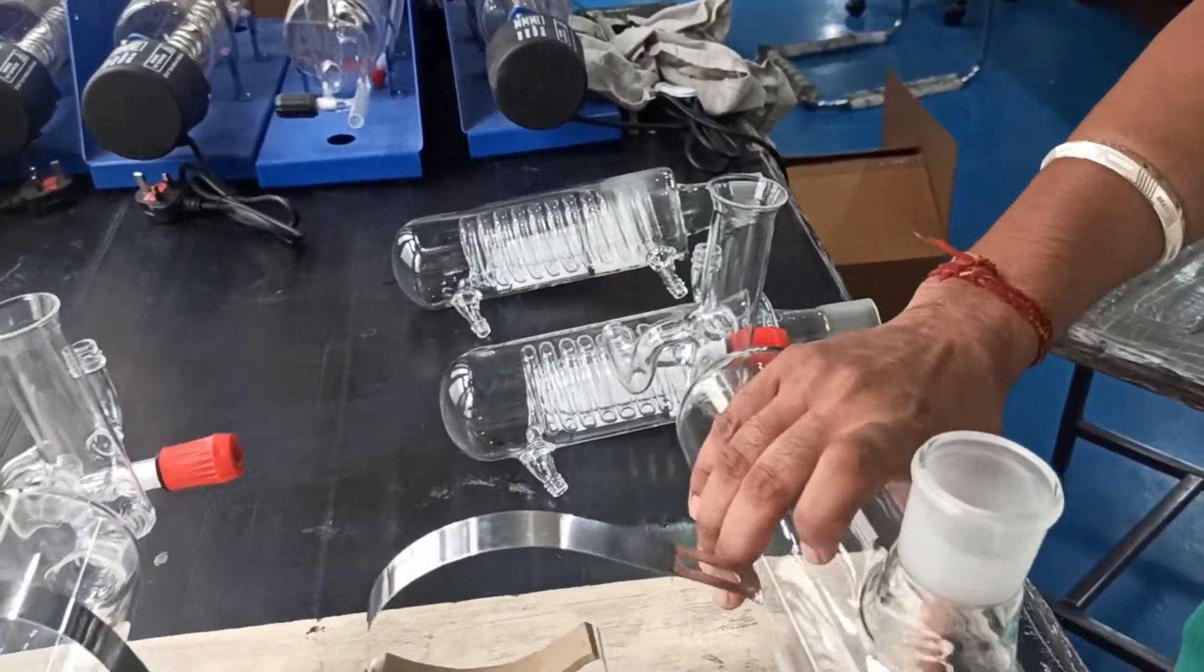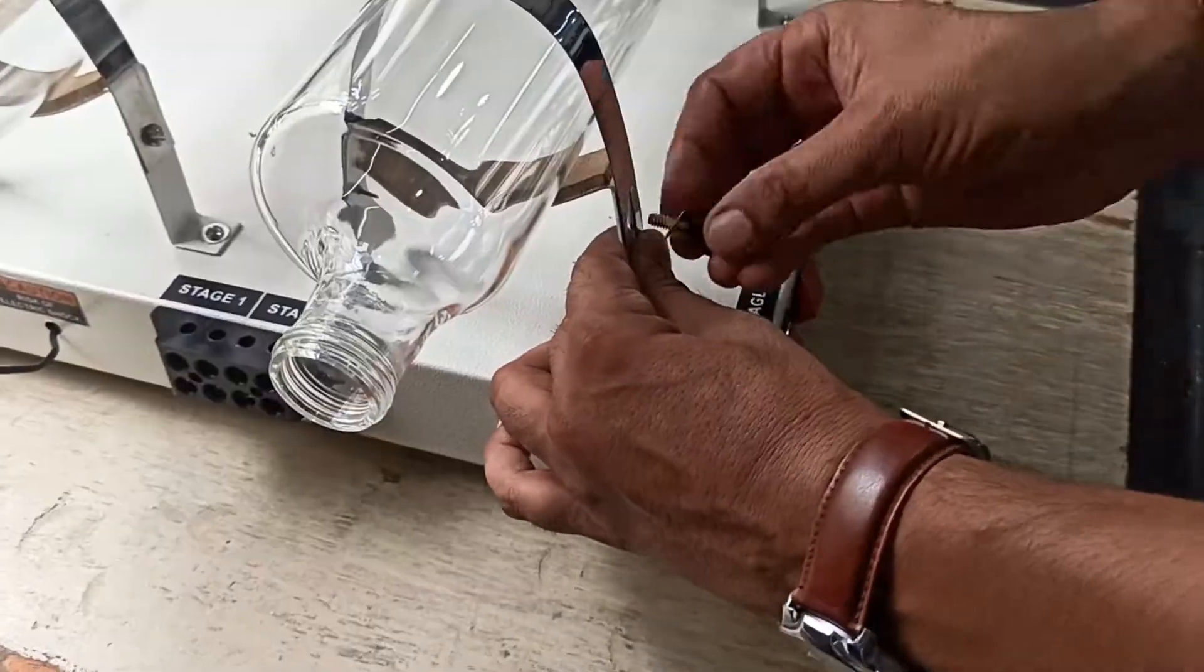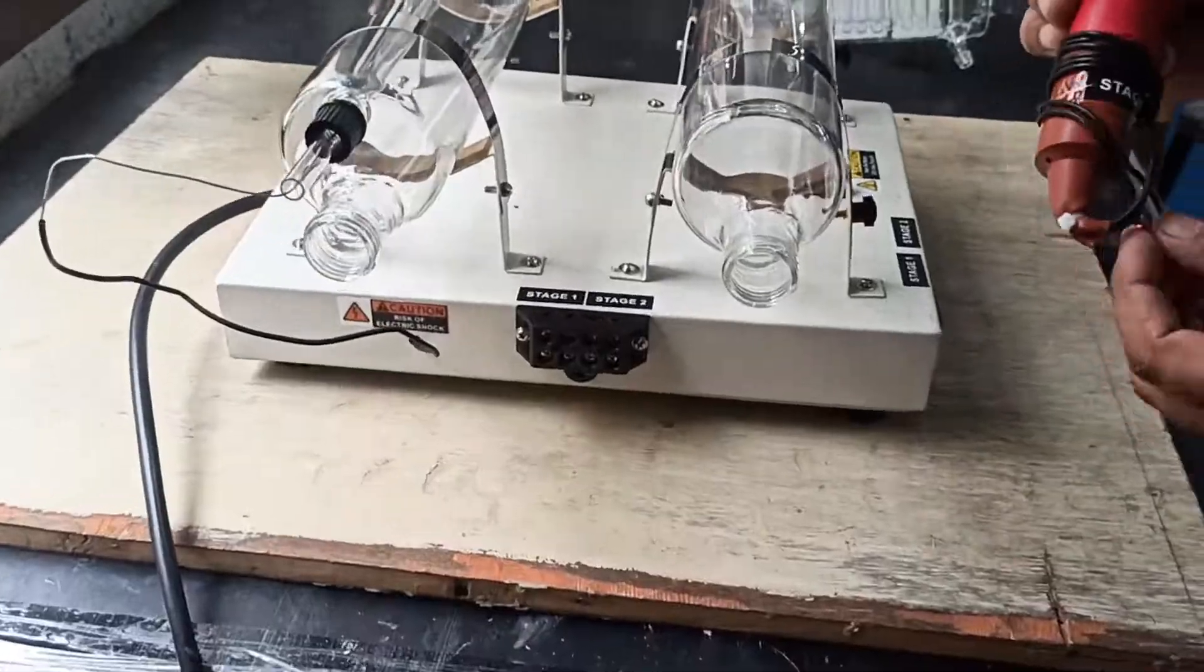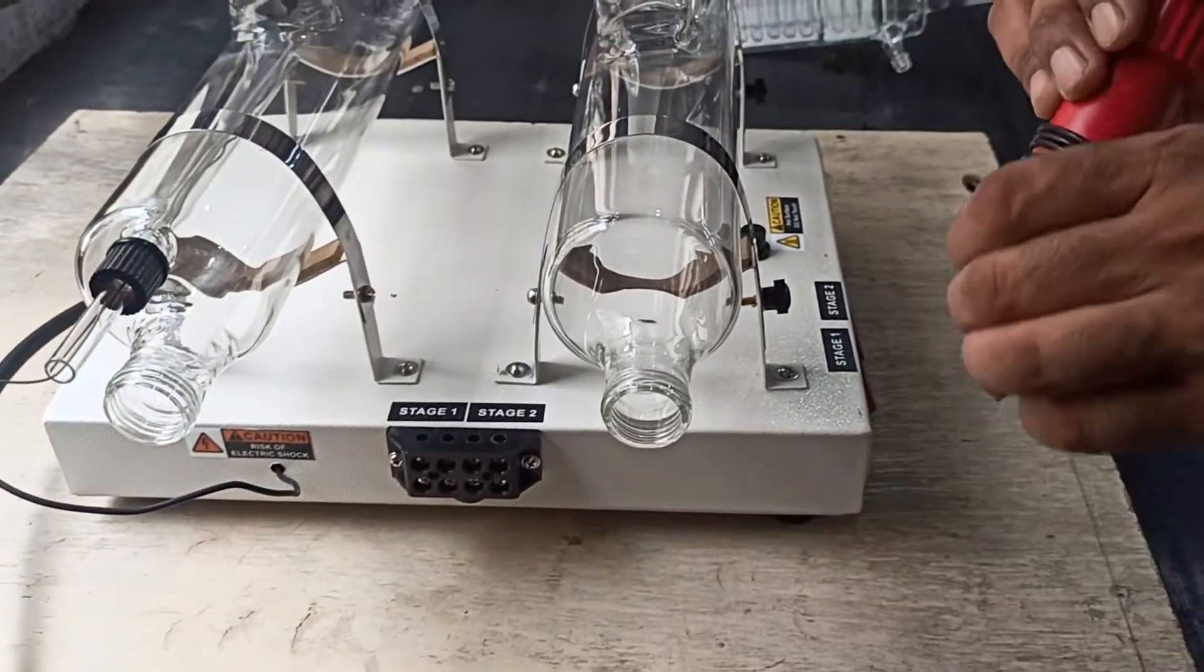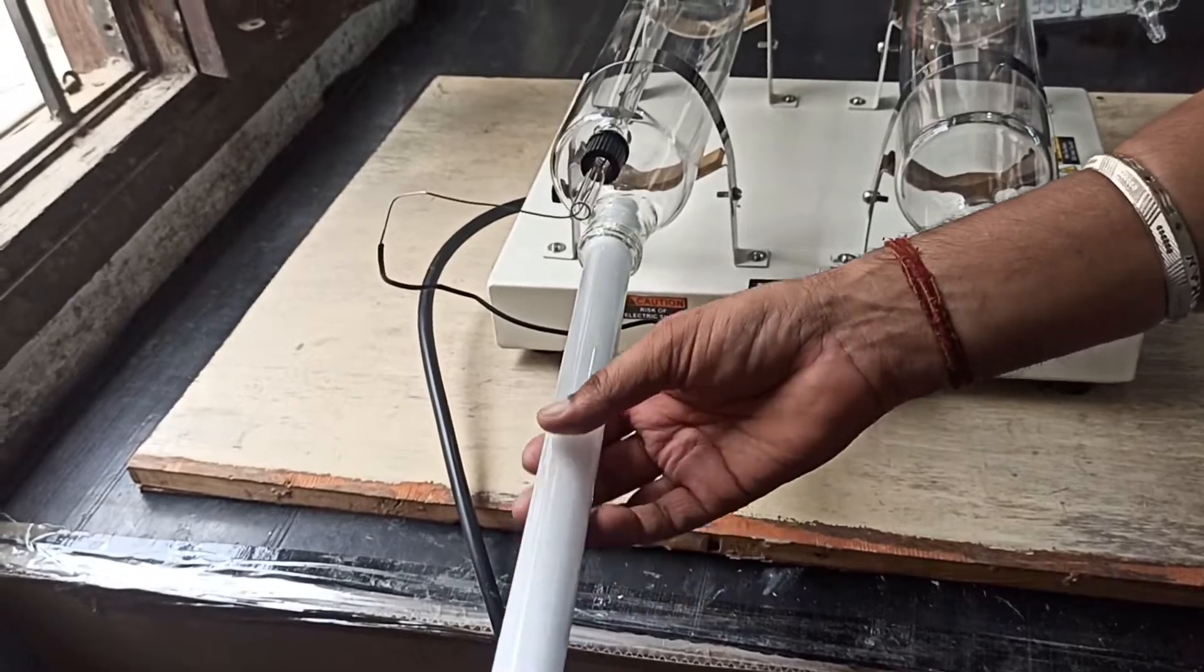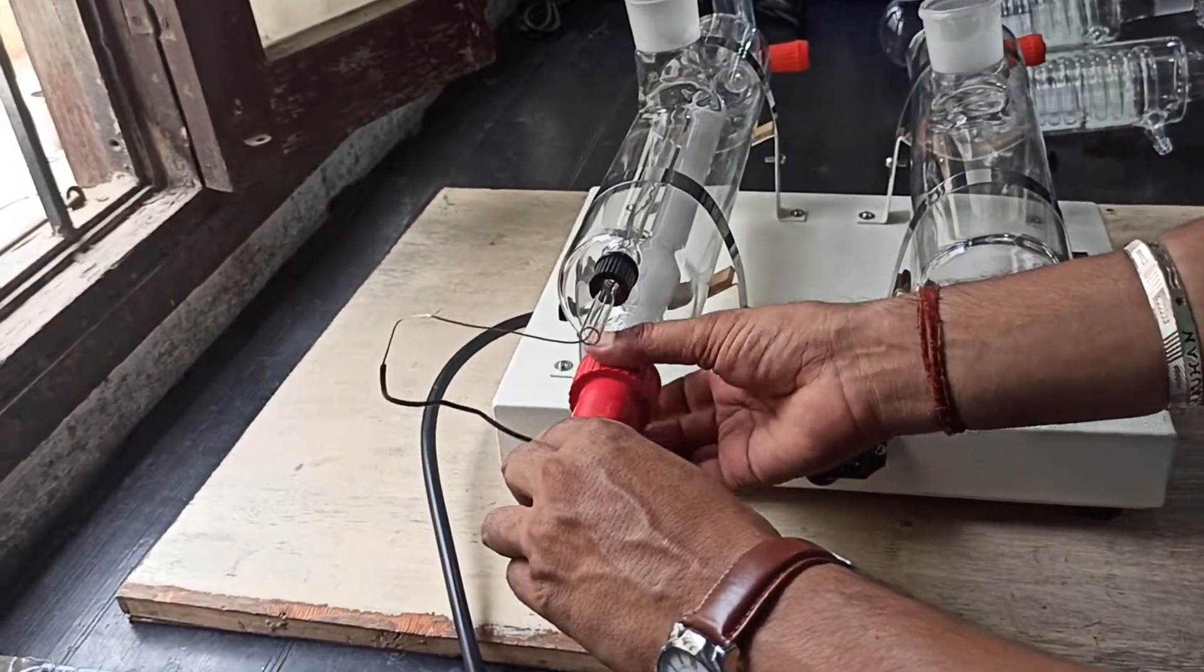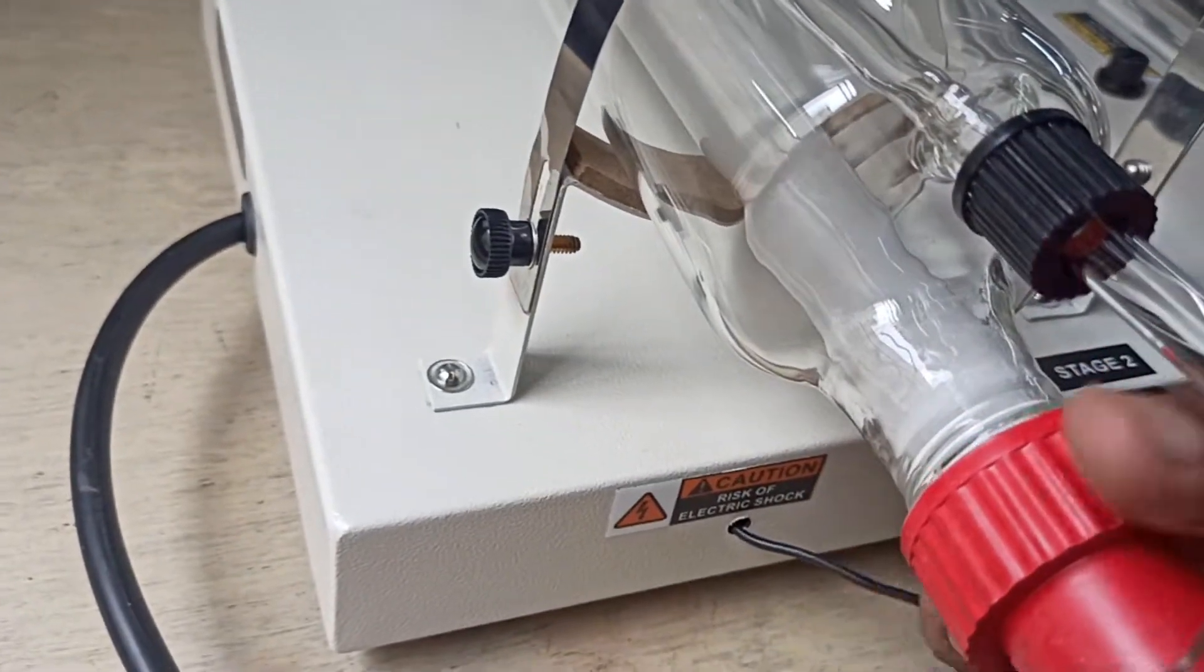Place the second stage boiler. Insert the first stage heater. There are two different heaters available for the first and second stages, so be very careful while placing the heater. Place the right heater for both stages. The heater should be placed deeply into the boiler.